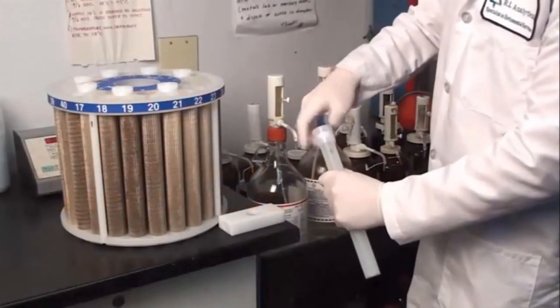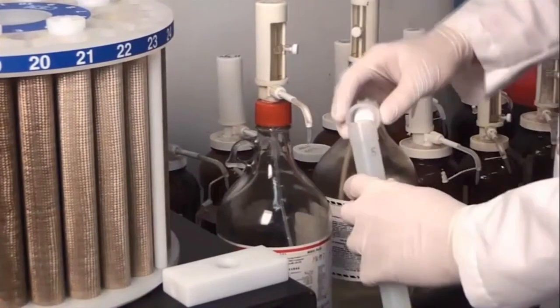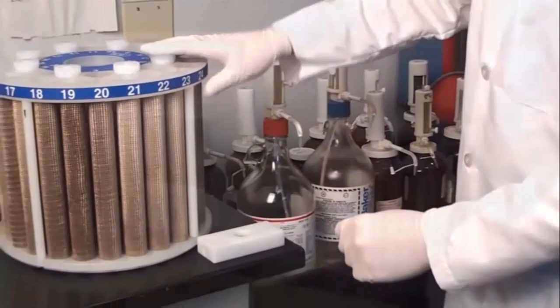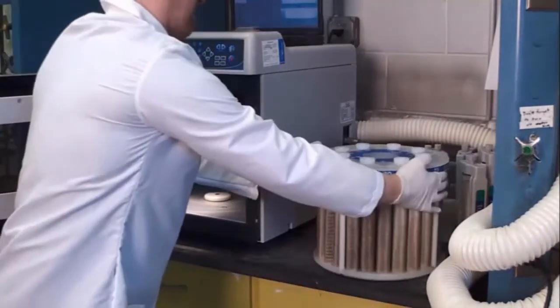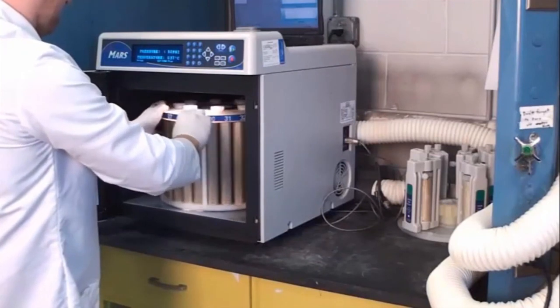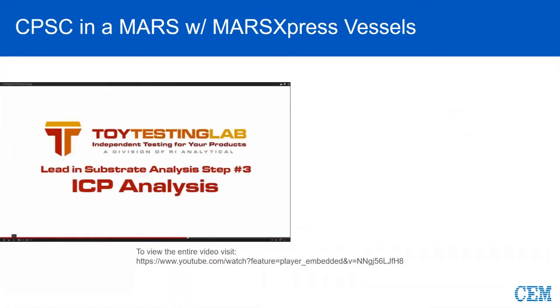Here's one of our technicians preparing a sample for microwave digestion. The process begins by adding one of several acids to the digestion vessel. Once the sample is prepared, the technician will load the vessel into the microwave carousel and place the carousel into the microwave. Microwave digestion is a standard operating procedure for the lead and plastic substrate material. The sample then goes off to the Meadows Laboratory for inductively coupled plasma analysis.